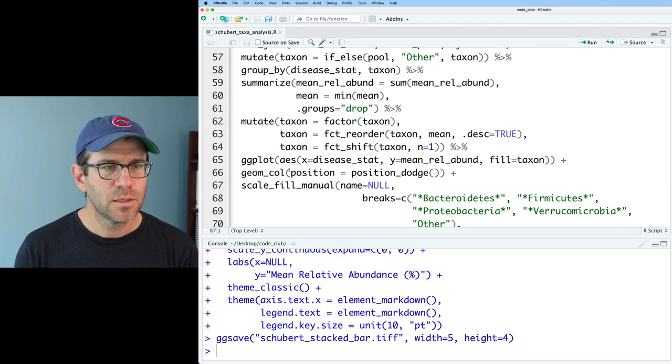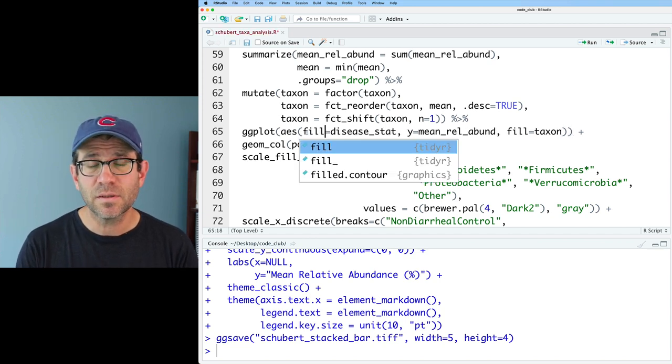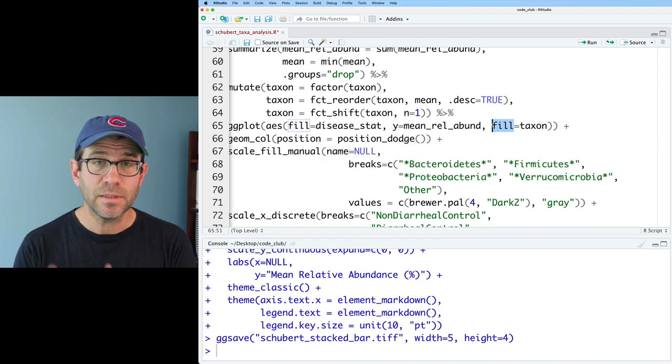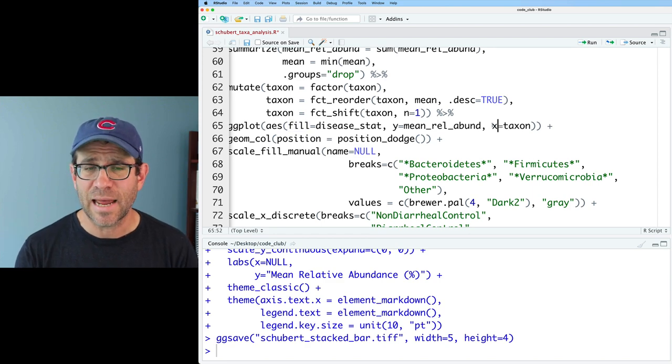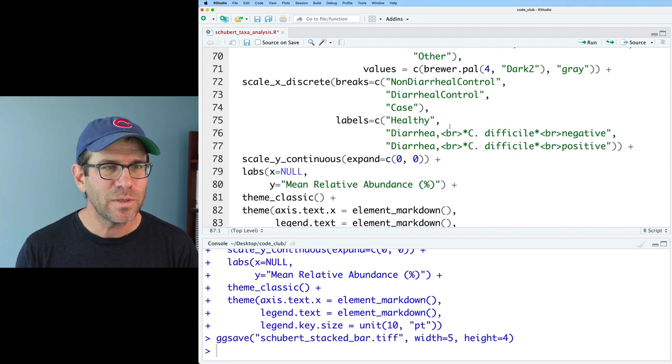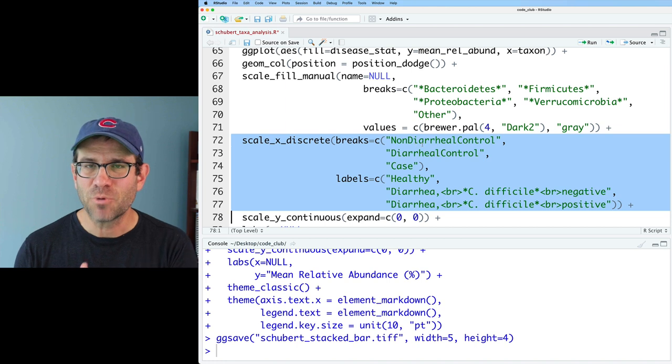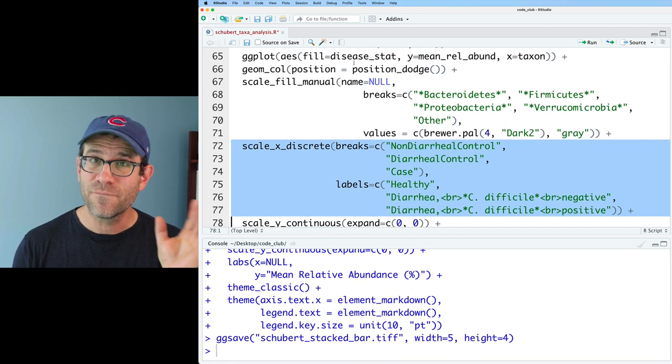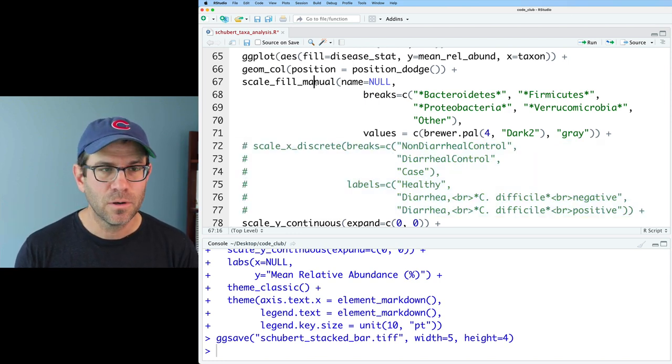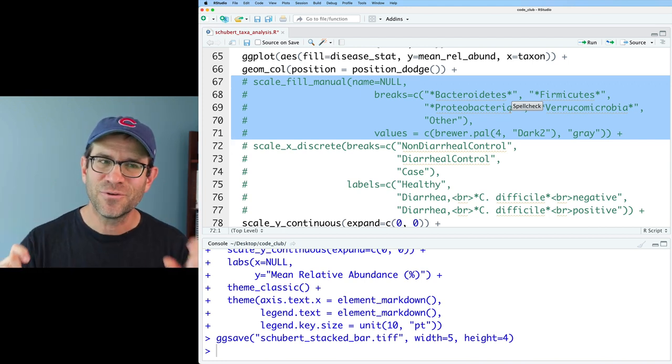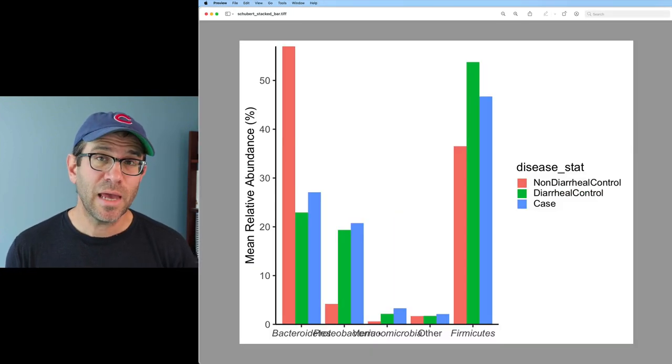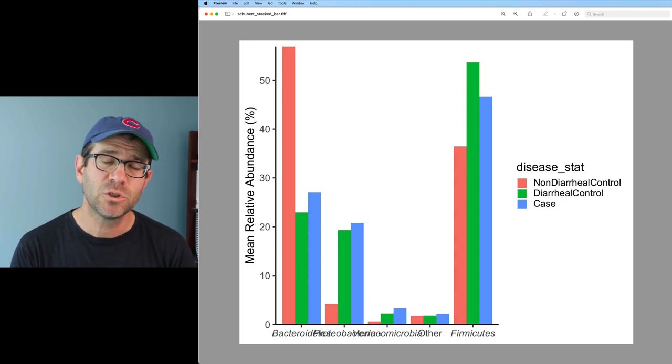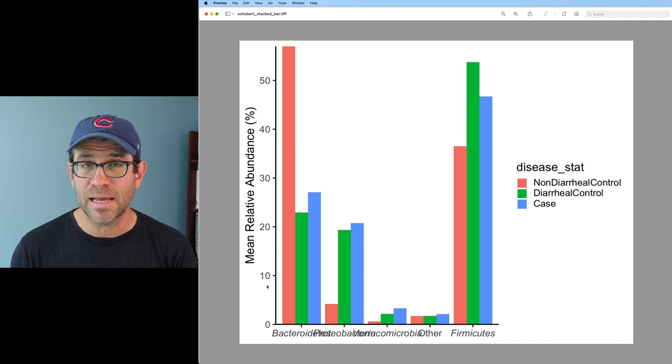To change the grouping, I'm going to come back up here to my ggplot line and instead of x equals disease_stat, I'm going to set the fill color to vary by the disease status. Also, instead of fill equals taxon, I want my taxa across the x-axis, so I'll say x equals taxon. And what we get back is a blank plot. Why is that? Well, that's because we set scale_x_discrete to have these breaks of non-diarrheal control, diarrheal control case, and those are our disease statuses, which are now the fill rather than the x-axis position. So I'll go ahead and comment that out. I'm not going to delete this code just yet because I'll probably want to reuse it because we'll want to shift scale_fill_manual and scale_x_discrete, and so I'll probably want to recycle this code later.